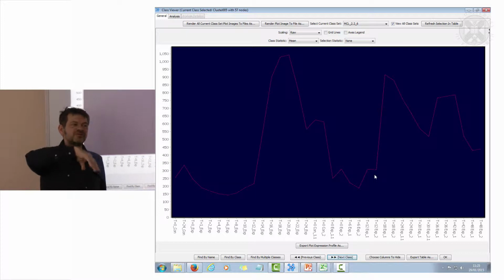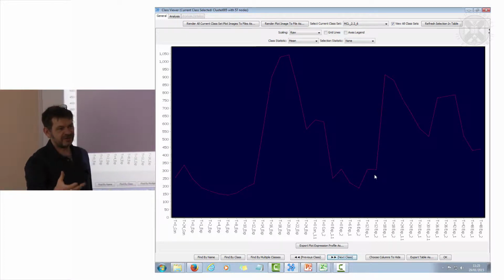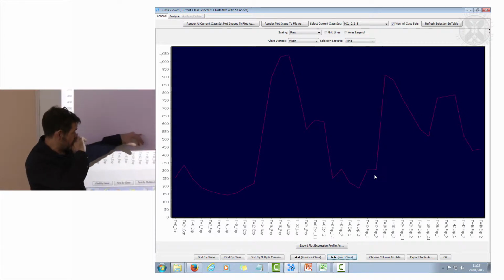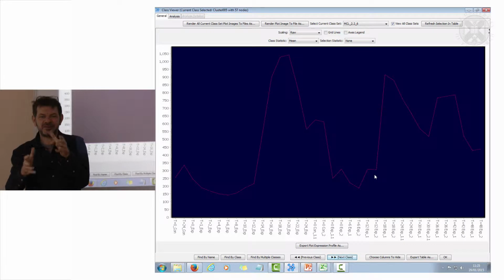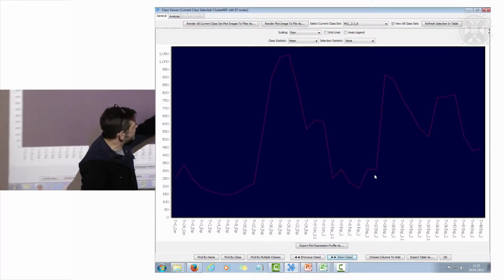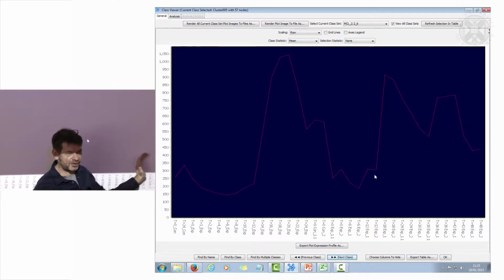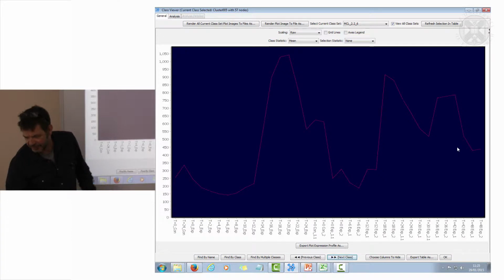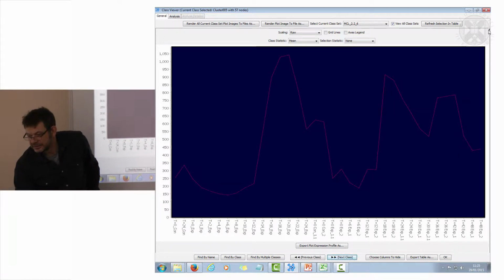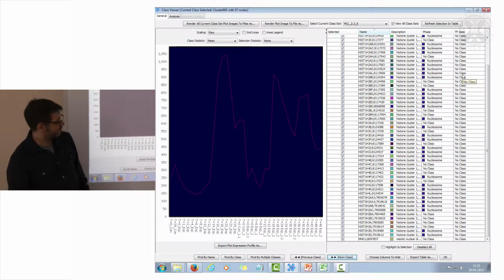When cells go into proliferation, there's the idea that they'll go into one cycle and then a second cycle. What tends to happen with fibroblasts is that they go into the cycle and then it becomes an asynchronous population. This tells us that it's not completely asynchronous and there's a second division going on within this second 24-hour time point. It's only these genes here that show that. And if I reveal the identity of these genes, histones, tons of them.